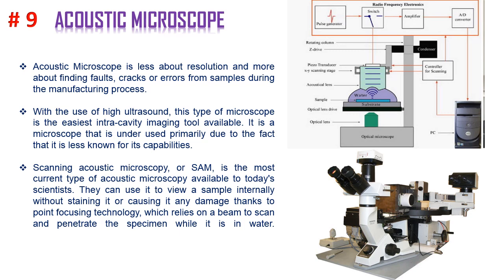They can be used to view a sample internally without staining it or causing it any damage, thanks to point focusing technology which relies on a beam to scan and penetrate the specimen while it is in water.